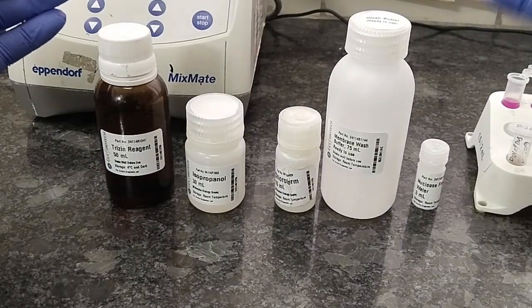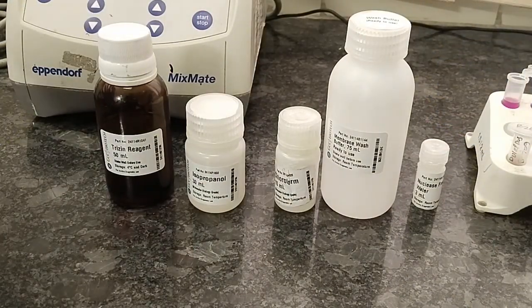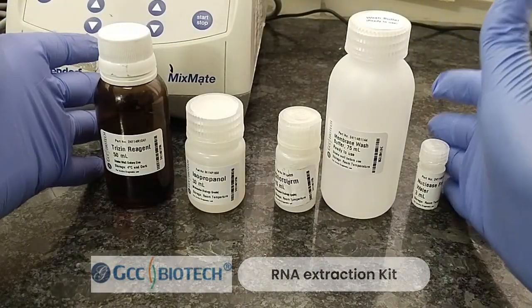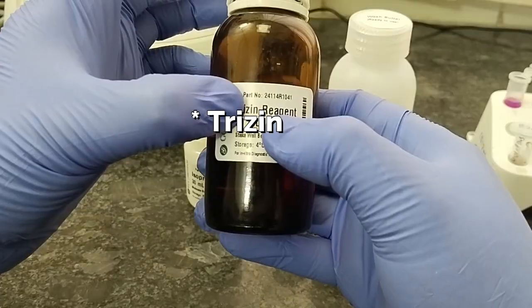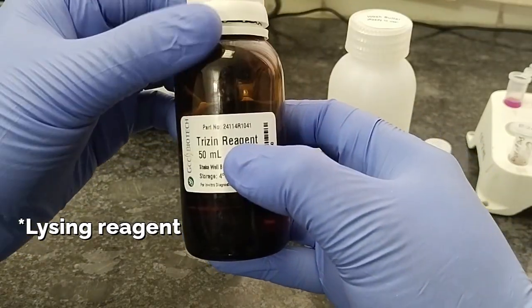As you can see, there are 5 reagents that are used for the RNA extraction. According to the kit, we are using the GCC Biotech kit. First reagent is called TRIzin reagent. TRIzin reagent is the lysing agent. It can lyse the virus, or destroy the virus, so that the RNA can come out.